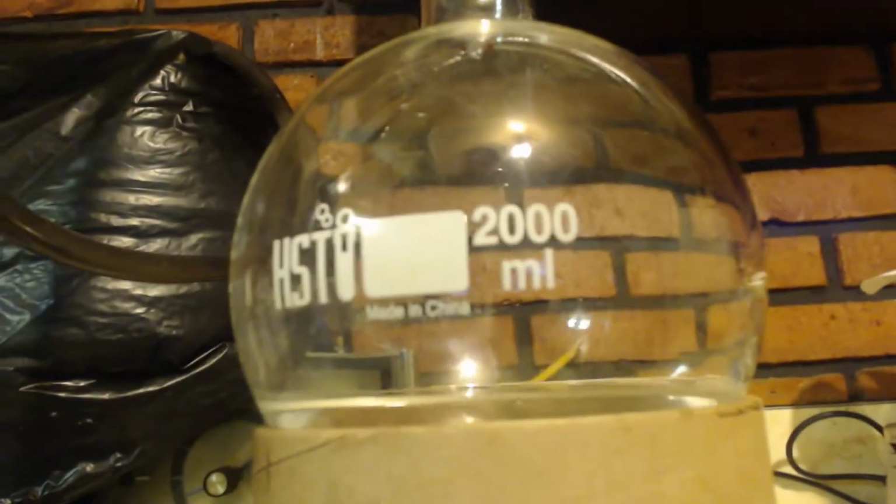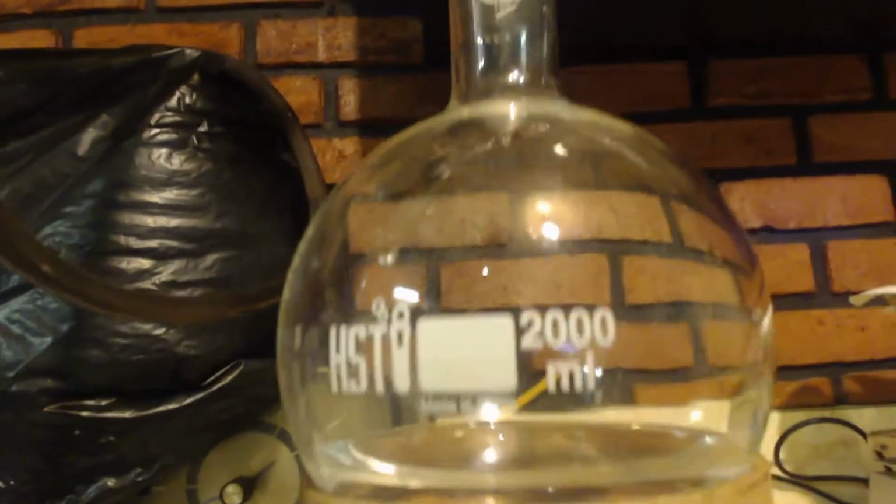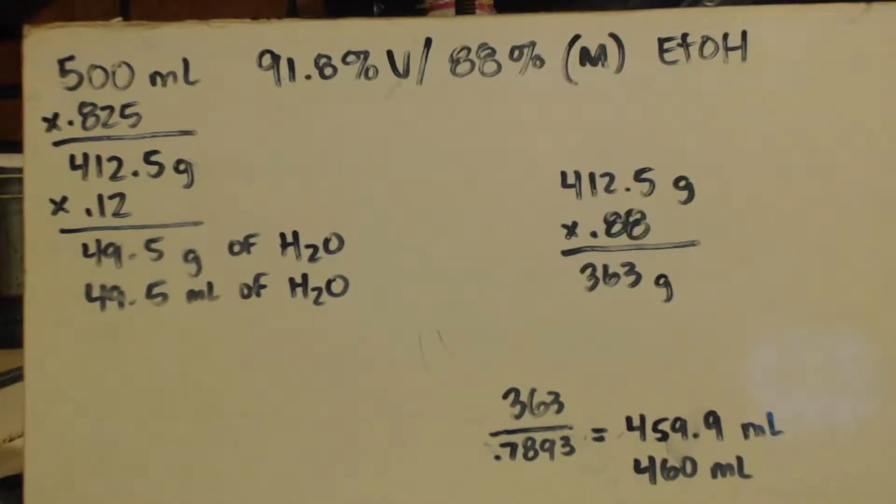Now I'm distilling from a 50-50 mixture, so I don't want to screw up my thing over here. I don't know if you can see the line that's right above where that thing is. Here, watch. See it? Right above there. So that should be 95%, or whatever the azeotrope is. I'm going to do a density test and we'll see. Let's do a little bit of math there.